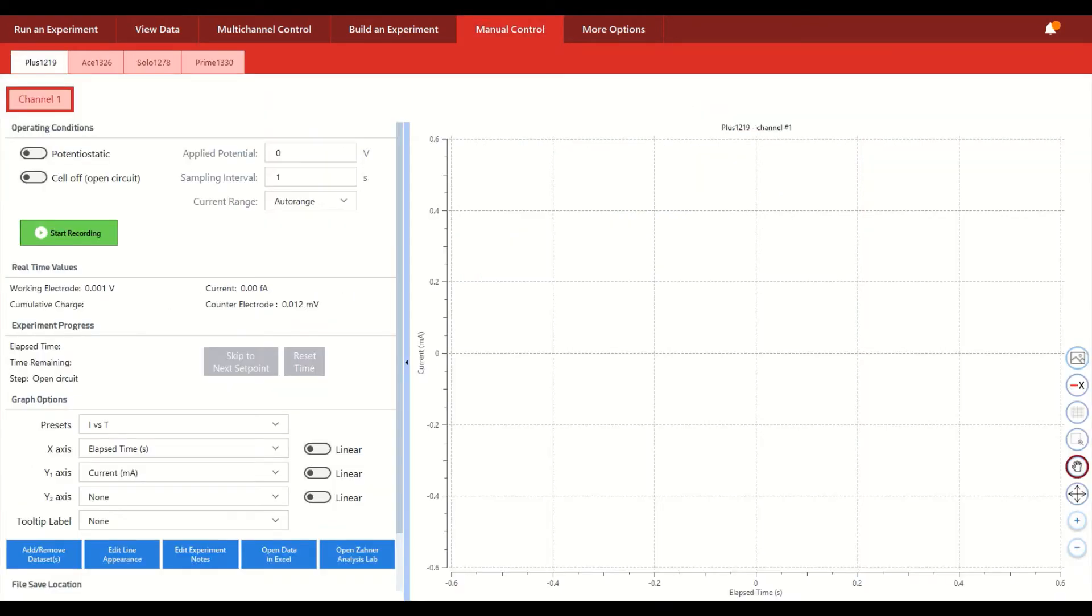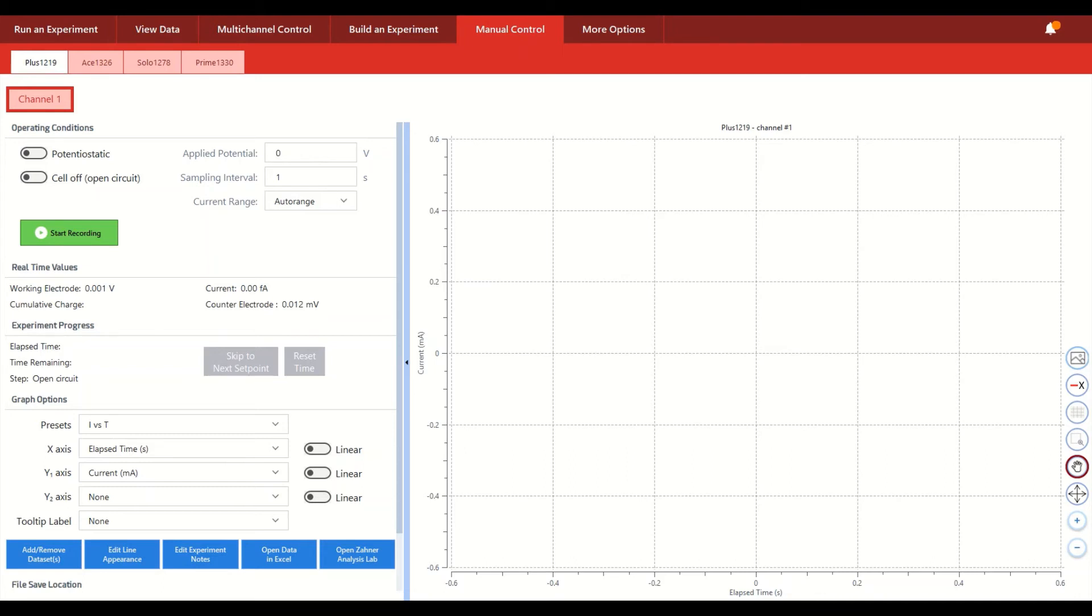The next menu is our manual control mode. So most potentiostats require users to type in all the different voltage or current set points that they want to apply or measure before a channel starts. However, for cases when a user might not necessarily know what the limits of their sample are or simply want to have the ability to change set points in real time to do some quick characterizations, again in the spirit of saving time, we have our manual control mode.